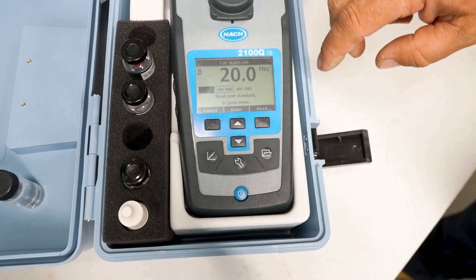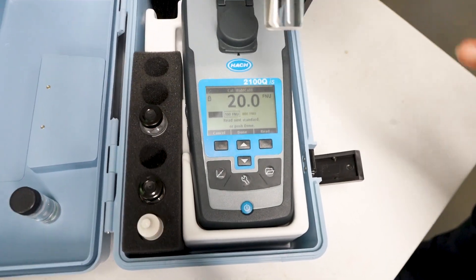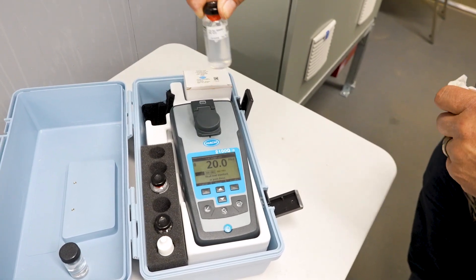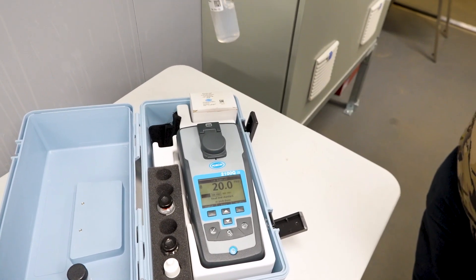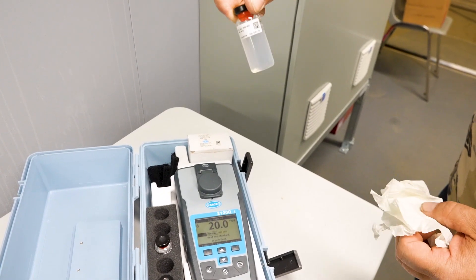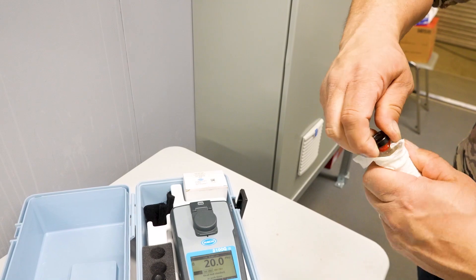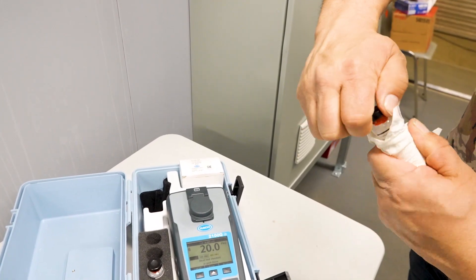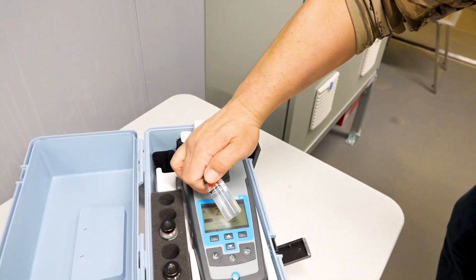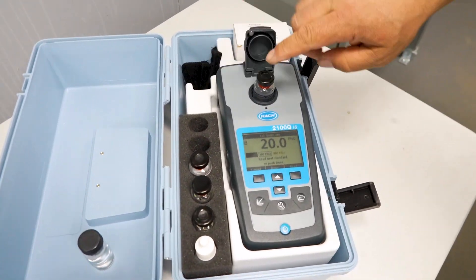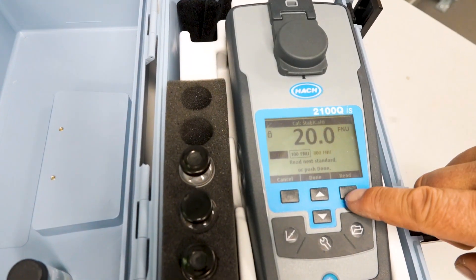Now once that's done, it's asking for the 100 NTU, which will be this one next, is labeled. But you see in the bottom, we've got to swirl that solution in together to get the proper NTU reading. Once it looks like it's evenly mixed in, wipe and polish your vessel, and put your arrow pointing to the arrow, after you've pulled this one out, back in, and then you hit read again.